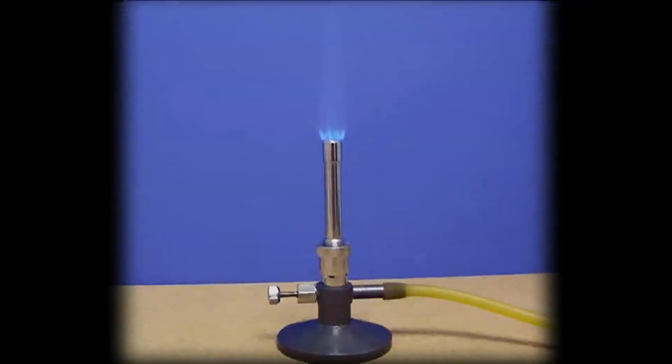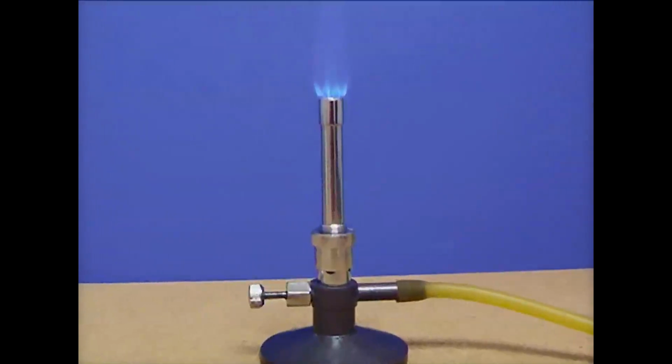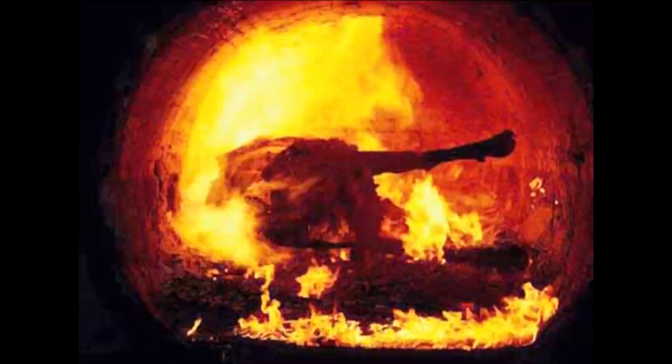The Bunsen burner has a temperature so high that it is sufficient to kill all the microbes present. We also use incineration in hospitals, wherein disposable gowns or OT items are first destroyed by incineration, and only then discarded into the environment.